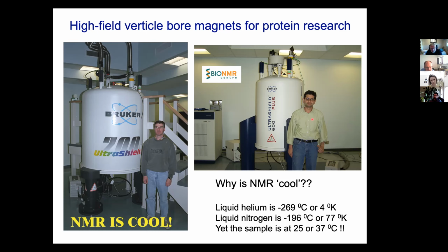So this is what NMR spectrometers look like. If you look closely here, there's a red thing on top. That's where the sample is going to go in. So you've got these really big magnets. Of course, we chose a relatively small guy to stand beside it, so it looked even bigger. But the sample really goes in here. So it's a really big instrument, and a really small sample goes in there. Then the sample sits somewhere here in the middle, and it's bombarded with radio waves. Here, it's difficult to see because this is our fraction collector that we use to put the samples in automatically, and it blocks. But there's another hole there, which looks like that hole where the sample goes in.